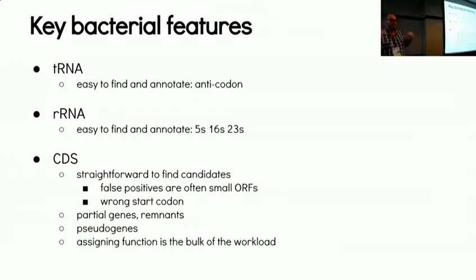They're not intact. They're in 2 pieces, 3 pieces. That's from reductive evolution or some event that didn't confer a selective disadvantage, so it just stayed broken. So sometimes it's difficult to distinguish assembly errors from real pseudogenes. That's often a problem.